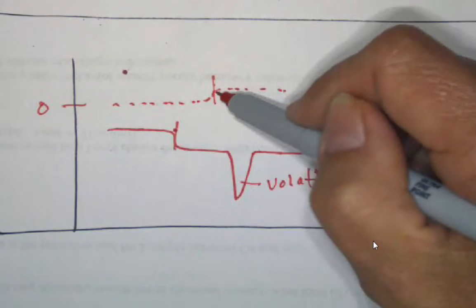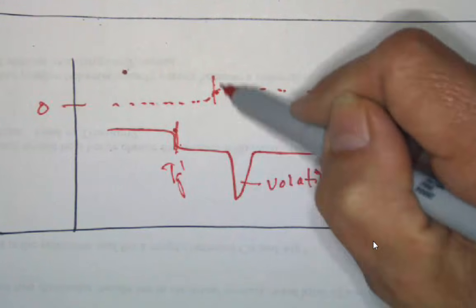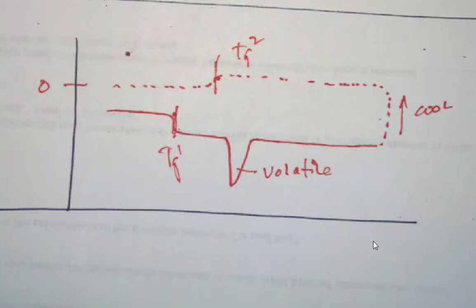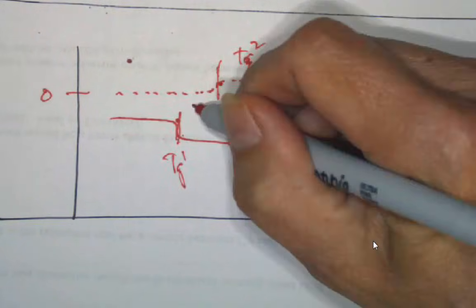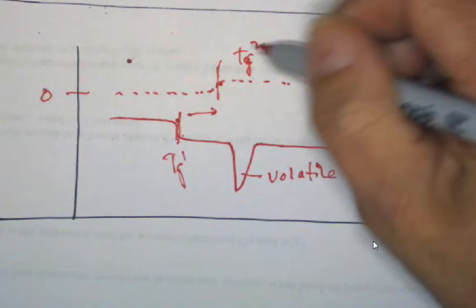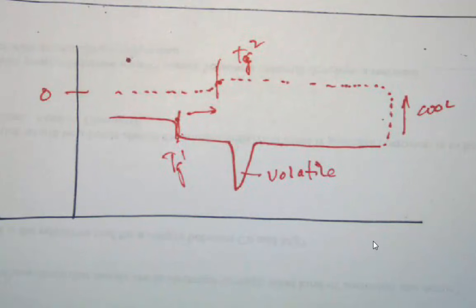I have a Tg on the heat up, and it shifts on the cool down. So I've had a Tg shift, Tg1, and there's my Tg2. They're no longer the same. So something altered the neighborhood, okay? So what would cause a Tg shift? Well, if the Tg shifted to a higher value, that means that mobility became more difficult. So what could leave and make mobility more difficult?